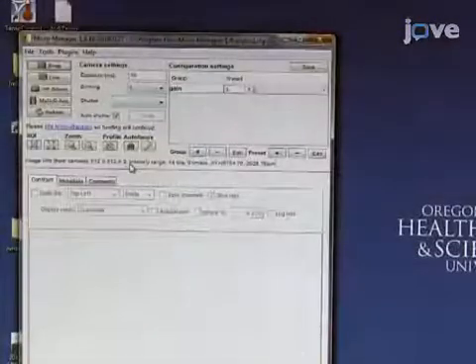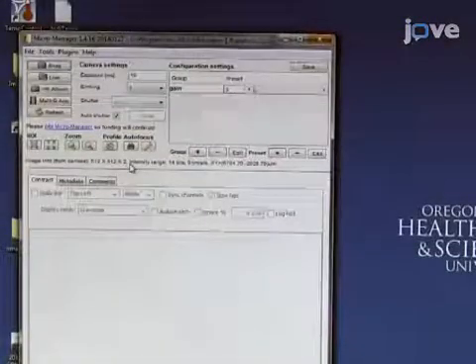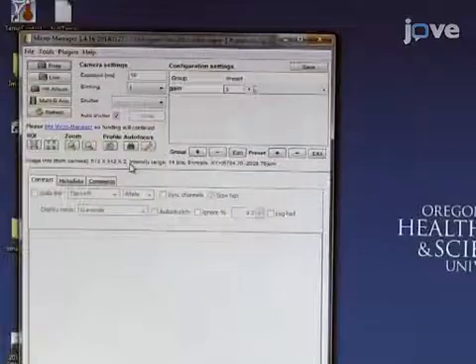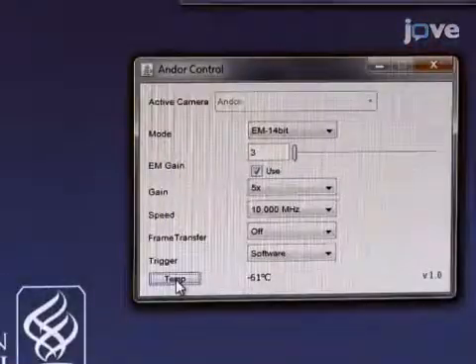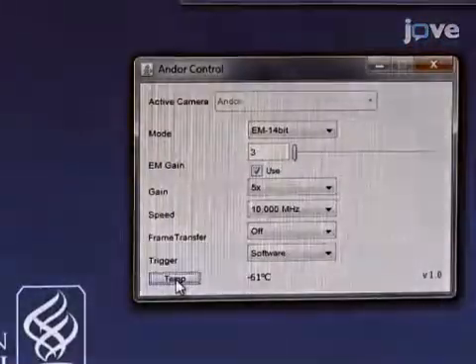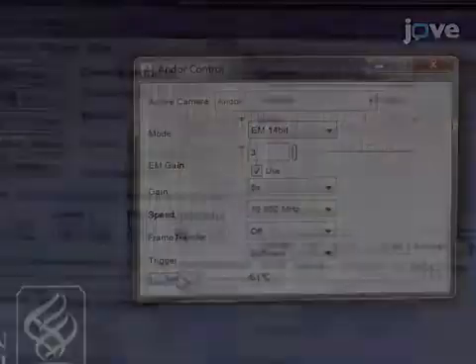Open the image acquisition software, turn on the EMCCD camera and allow it to cool down, and set the exposure time to 100.